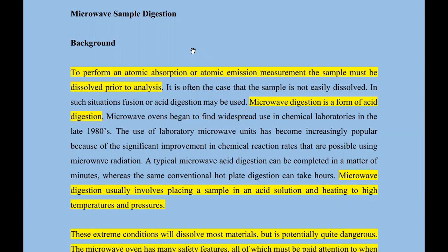and put it into a usable form. Now, you may have this solid sample here. The solid sample is very huge.